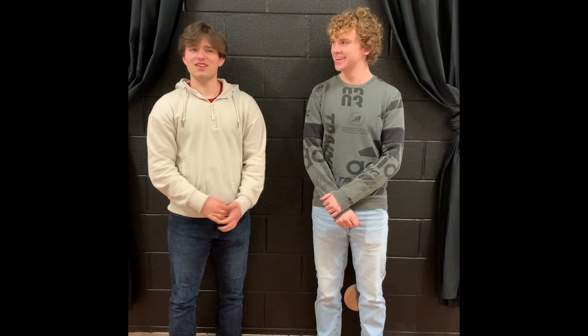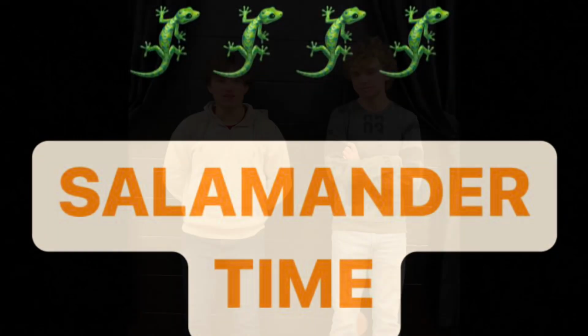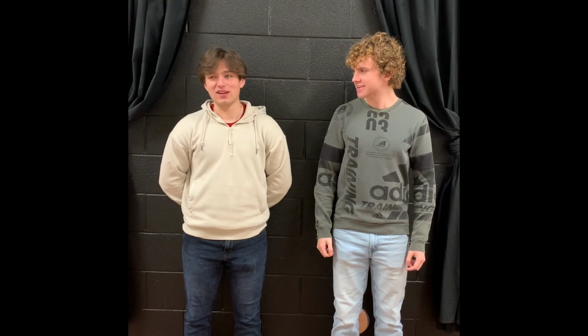Today, we're looking at salamander anatomy and dissection. Let's talk about that. Hey guys, today we're gonna be dissecting a salamander and analyzing all the different parts of its body. Let's start learning about the salamander.